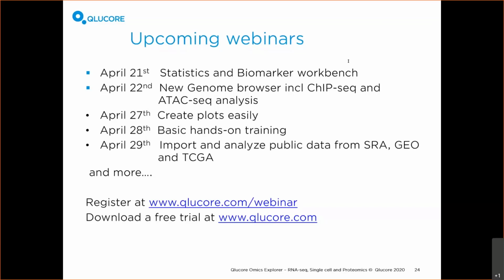And then I got another question here. Will this work as well for Aptamer-based assay data, SomaScan data? I'm not sure. I think it's not a platform that I recognize, so I think it's more like what type of files can you output from there? Can you output BAM files or text files? In that case, yes, we support it. If it's some other file formats that I haven't touched on here today, you might need to convert to the more general file formats.